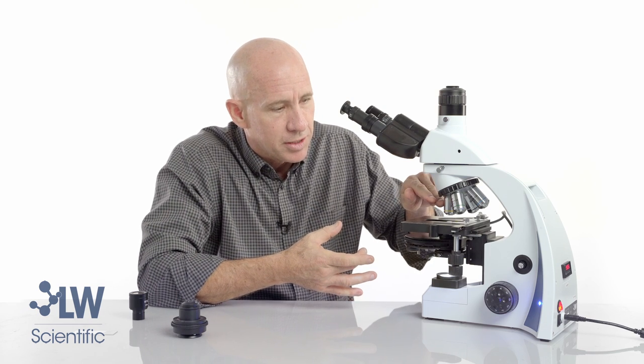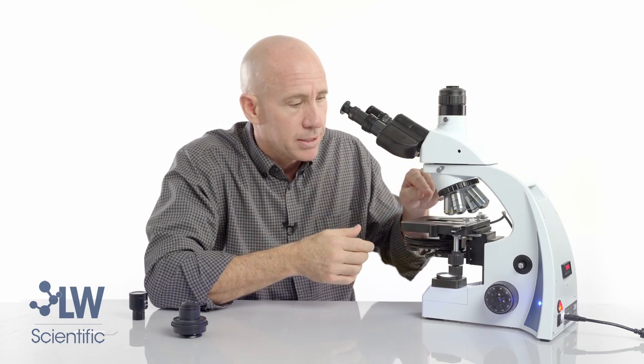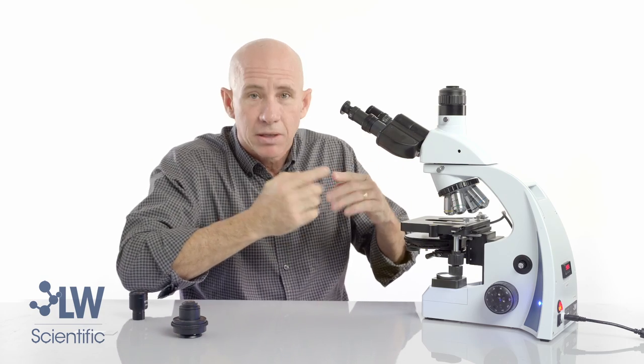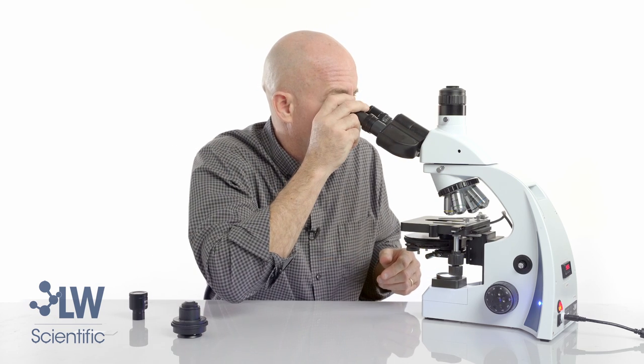The dark donut inside the objective is blocking the direct light, so when you use the microscope in phase you're not staring directly into the light — that's how phase contrast works. The halo comes up, hits the specimen, and then the donut blocks the direct light, even though the specimen will be fully illuminated. I have now lined up my 10x objective.